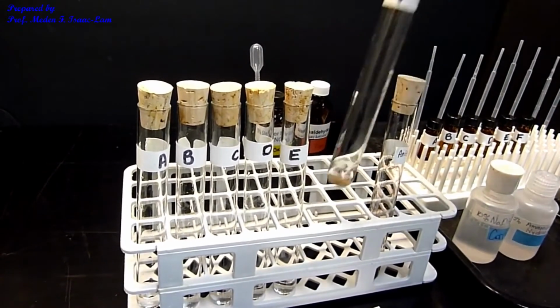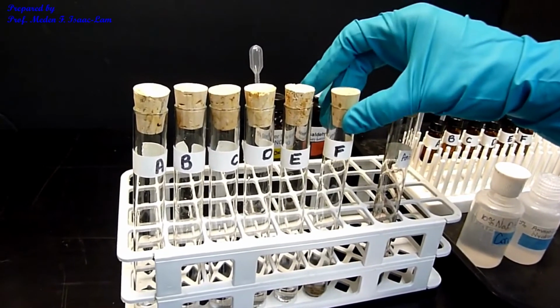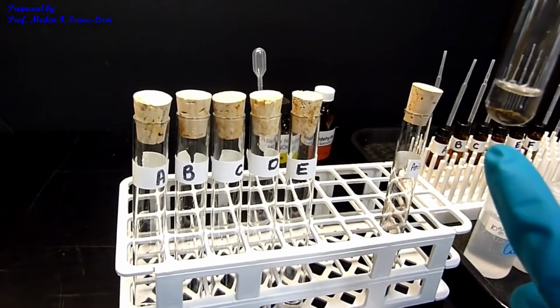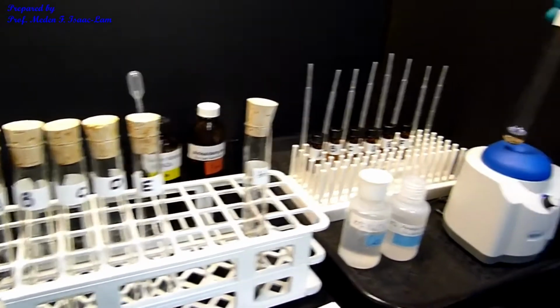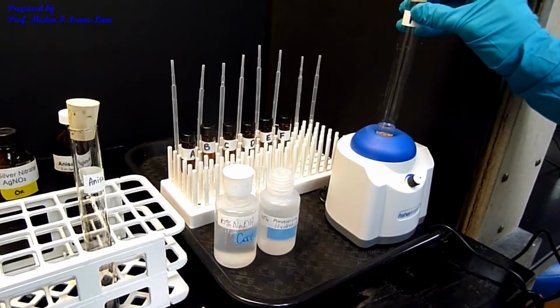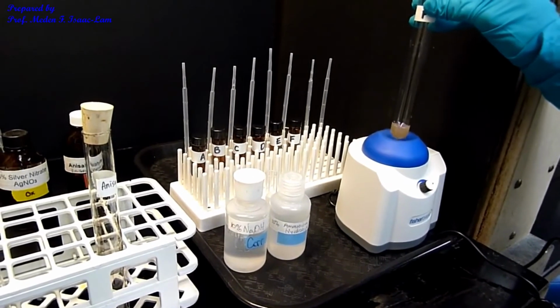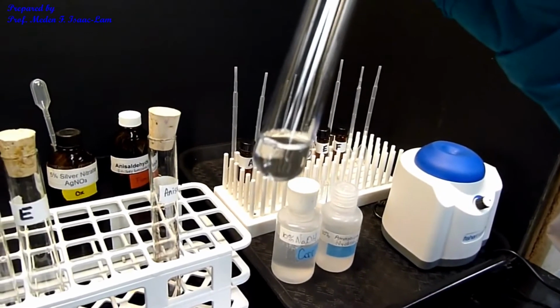This is the solution before I shake it. So the precipitate at the bottom is brown. And then if I shake it, if I vortex it, it will dissolve. So that is now clear.